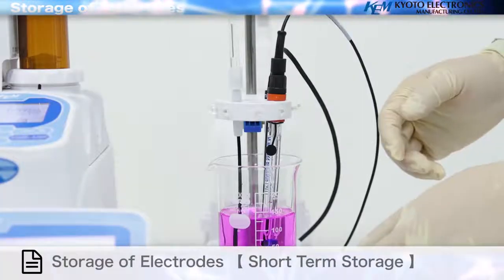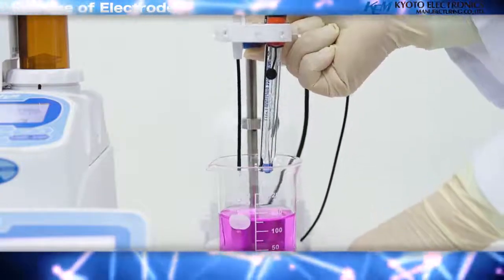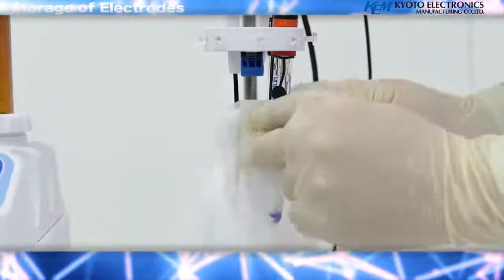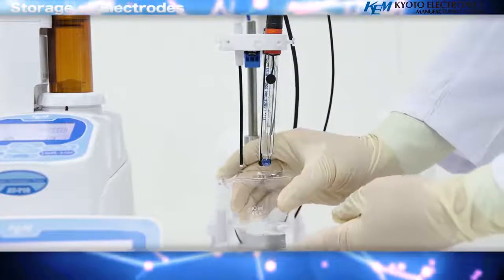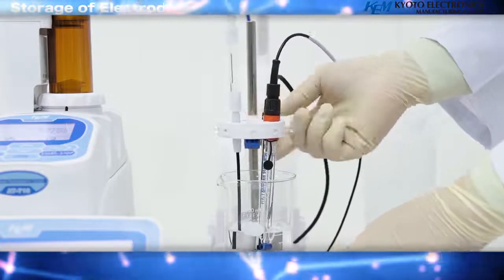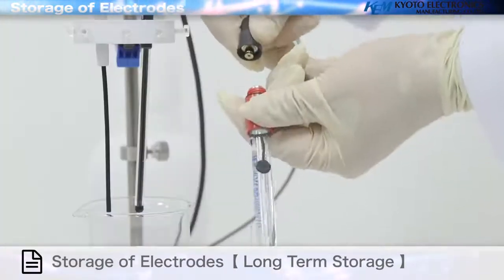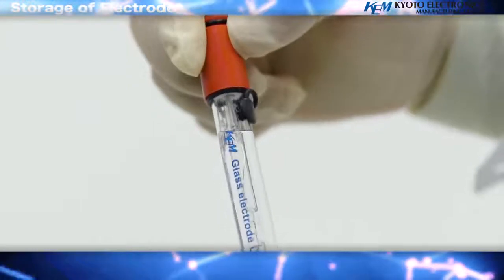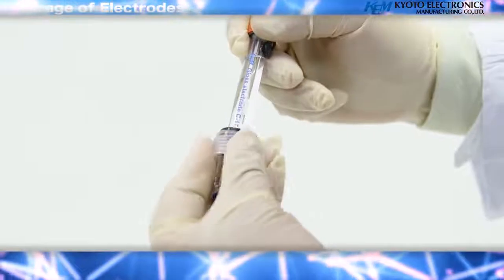Short term storage: remove the electrode from the measured solution. Rinse the electrode with pure water and wipe with clean filter paper to remove any contamination from the electrode. Storage is completed by placing electrodes in a preservation solution or pure water prepared in advance. Long term storage: for long storage periods, place the electrodes into a preservative solution in the included electrode preservation bottle and tighten the cap firmly.